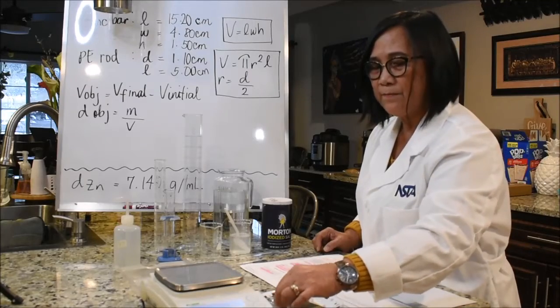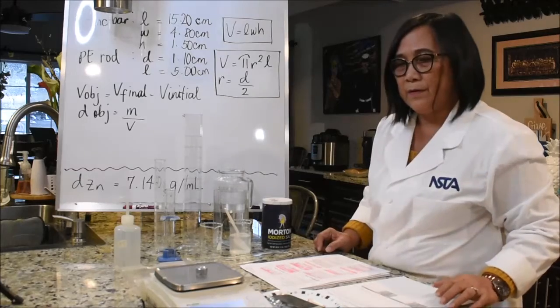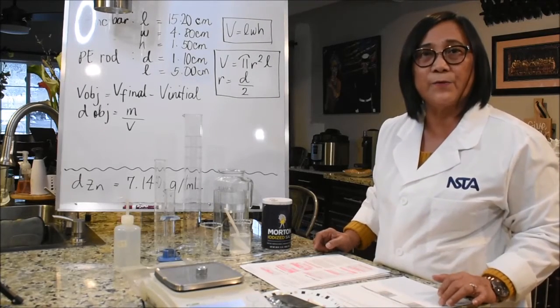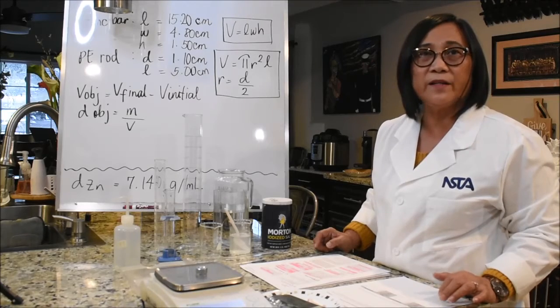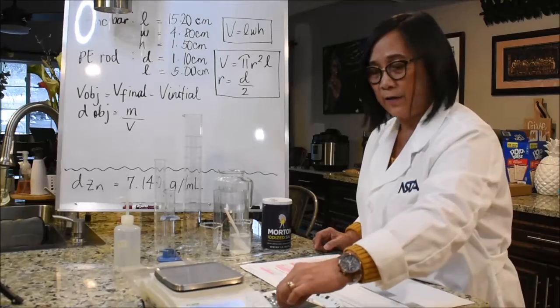And lastly, our steel bolt, the mass of which is 15.6 grams. 15.6 grams. Please record those data on your data table.